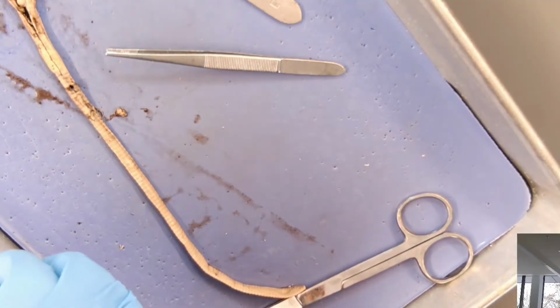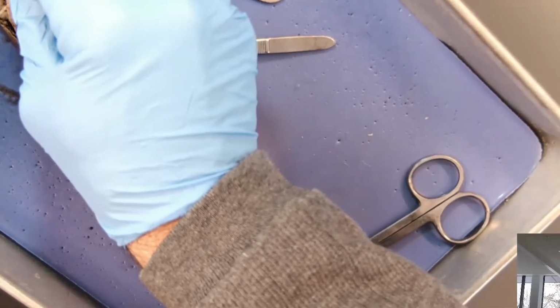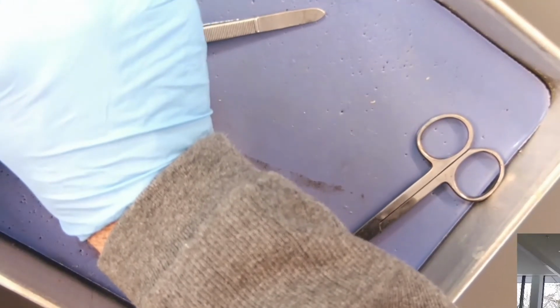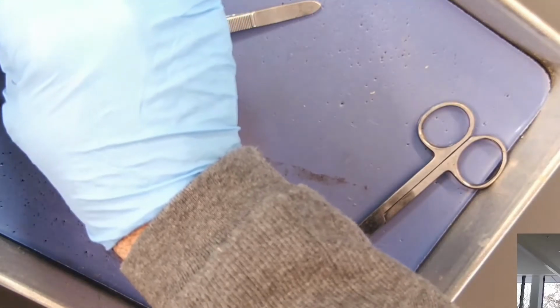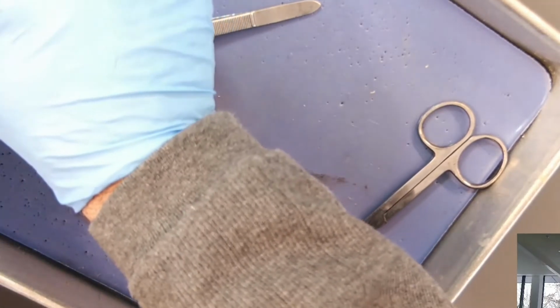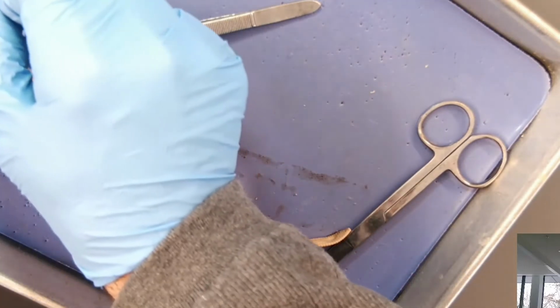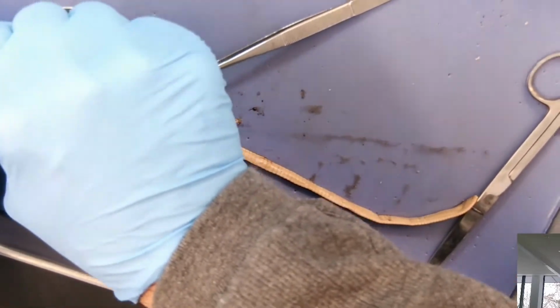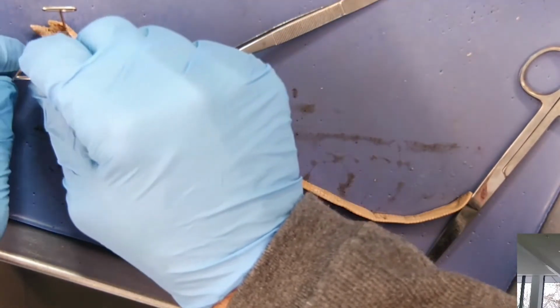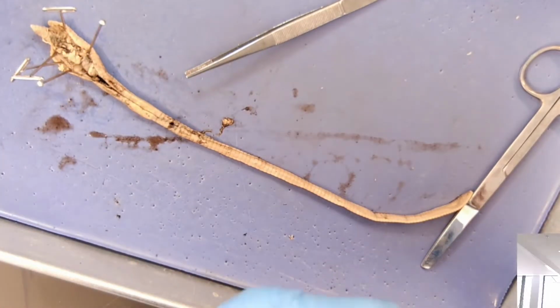And interestingly enough, when I cut that open, I severed part of the intestine, and you saw that black material, which is a combination of digestive material, soil particles. Earthworms are actually great for aerating soil because as they bore through and feed upon organic matter, they help with decomposition, eating the dead material, but they also, as they crawl through the soil, they create pores that can collect oxygen so that the earthworms can breathe. But they also aerate the soil for other types of organisms that's helpful as well.